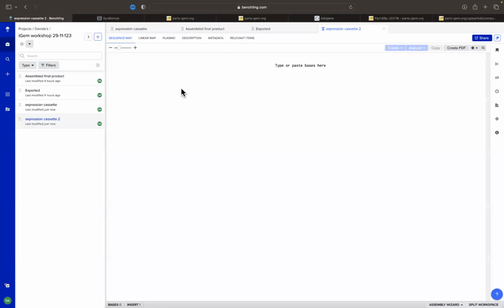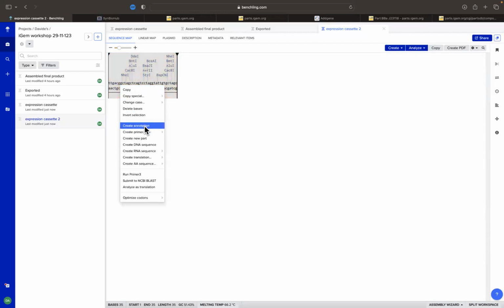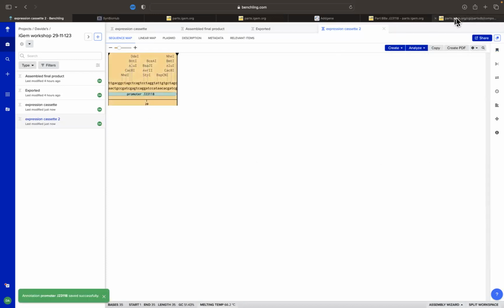and then we go to, in this case, Benchling. Benchling is a platform that we use for gene engineering manipulation in silico, obviously, so on a laptop. There are other software options. Benchling is an online platform and is shareable, which is something that teams inside research groups really appreciate. So we put it here. You can also use other software; for instance, SnapGene is very famous for what we do. We can make an annotation and say this is our promoter. This is going to be important in a second.